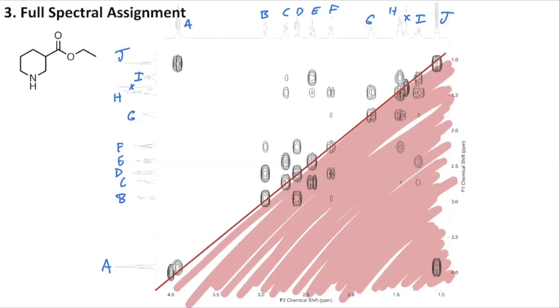So I'm going to take a moment to just put in all of these lines, and then we'll regroup to talk about which peaks are our cross peaks in a moment.